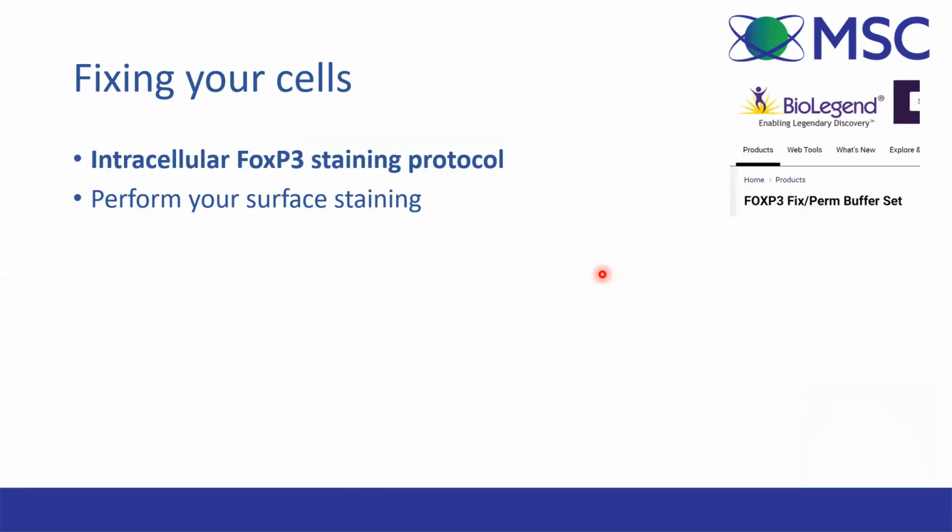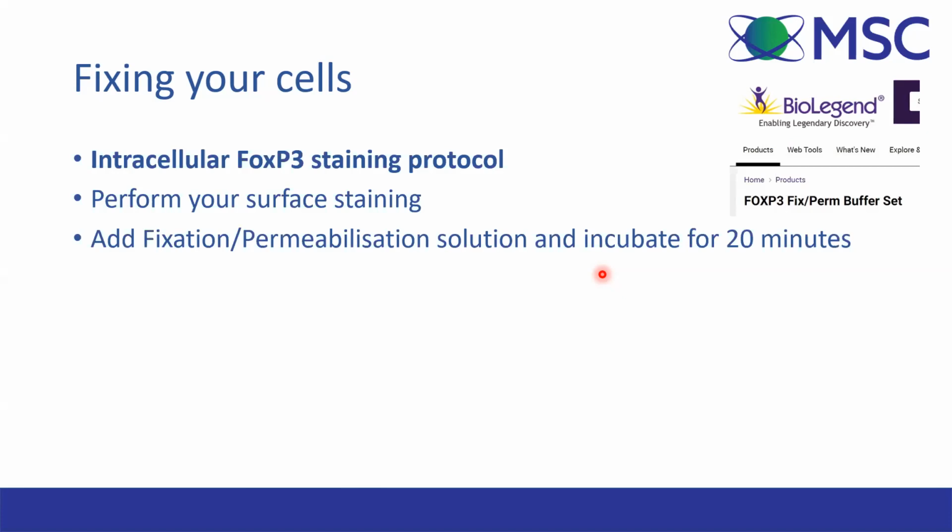So now I'm just going to show you this FOXP3 intracellular staining protocol, just to show you how simple intracellular staining can be. Using the FOXP3 fixation/permeabilization buffer set from BioLegend, all you need to do is get your cells, perform your surface staining as usual, add your fixation permeabilization solution to the cells and incubate for 20 minutes.